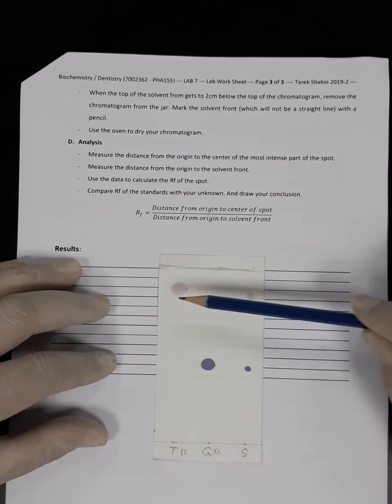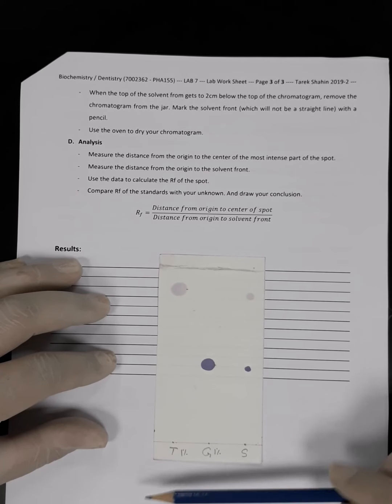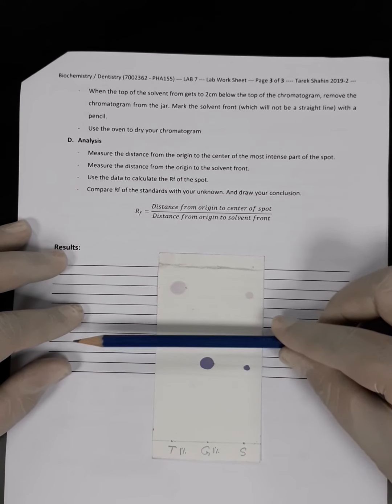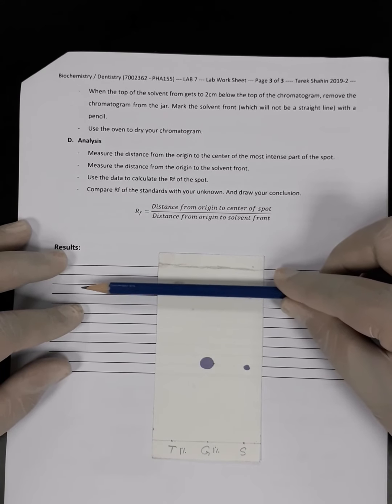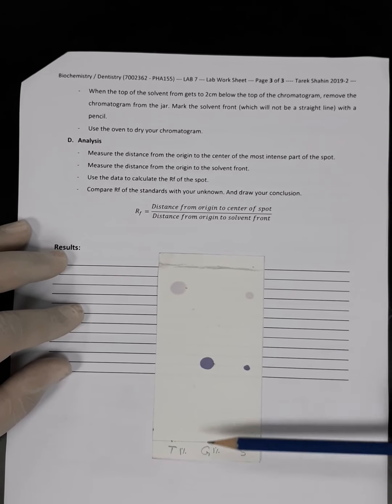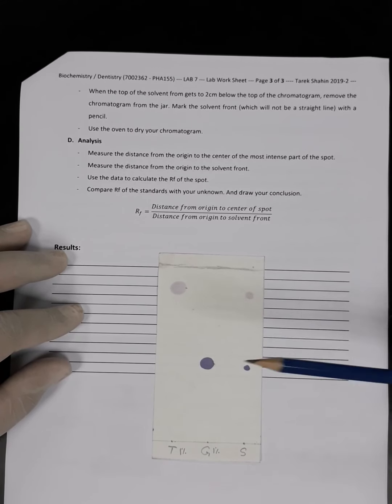Okay, what is the reason for that? Tyrosine has very low polarity, so it will be more soluble in the mobile phase. So when the mobile phase moves up, the tyrosine will move with the mobile phase for a longer distance, while the glycine has high polarity, so it kind of sticks to the stationary phase. That's why it will not travel a higher distance with the mobile phase.